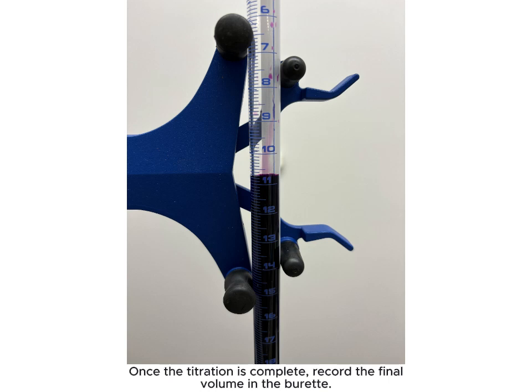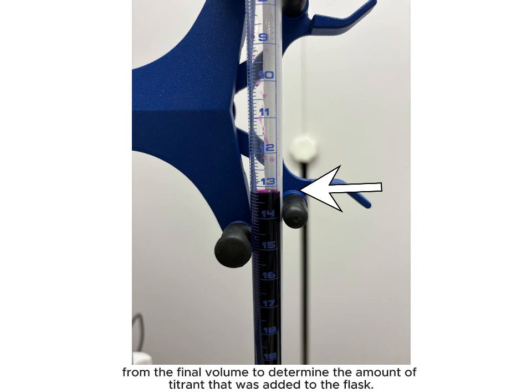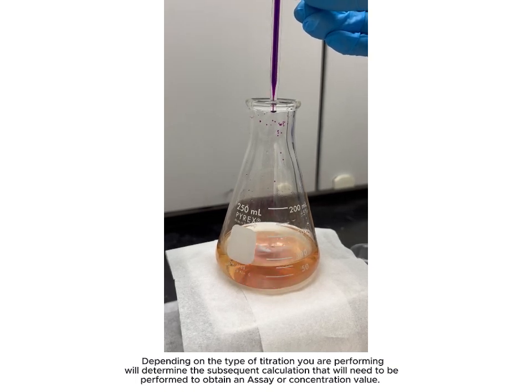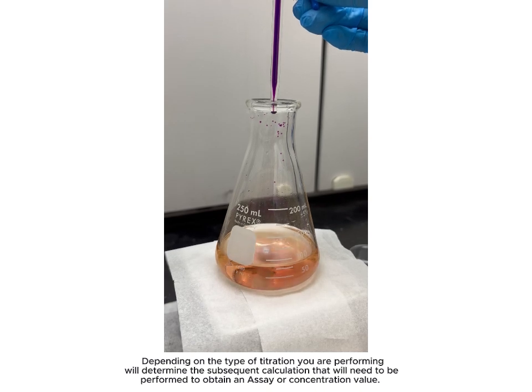Once the titration is complete, record the final volume in the burette. The initial volume is subtracted from the final volume to determine the amount of titrant that was added to the flask. Depending on the type of titration you are performing will determine the subsequent calculation that will need to be performed to obtain an assay or concentration value.